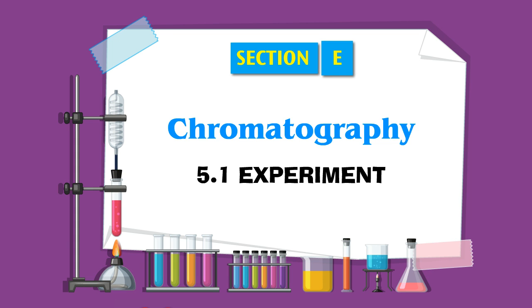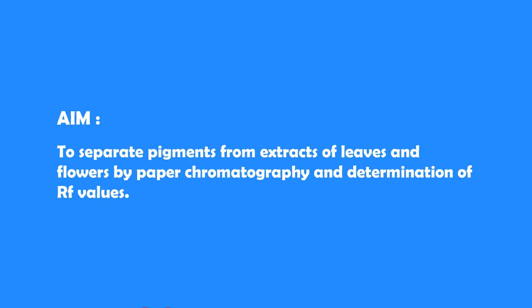Section E, Chromatography. 5.1 Experiment. Aim: to separate pigments from extracts of leaves and flowers by paper chromatography and determine RF values.